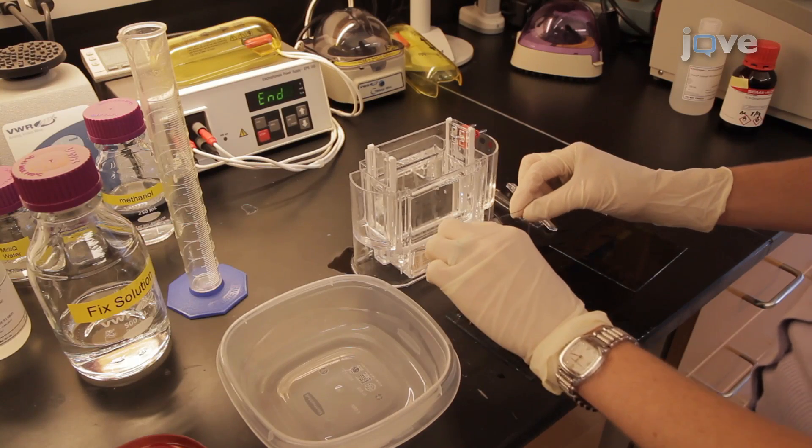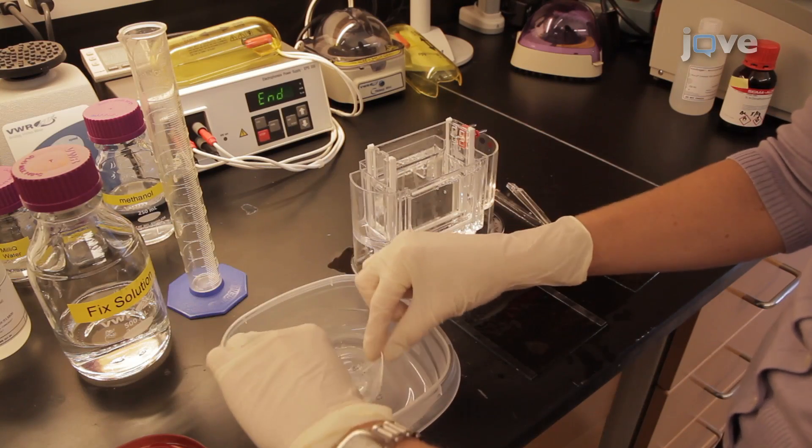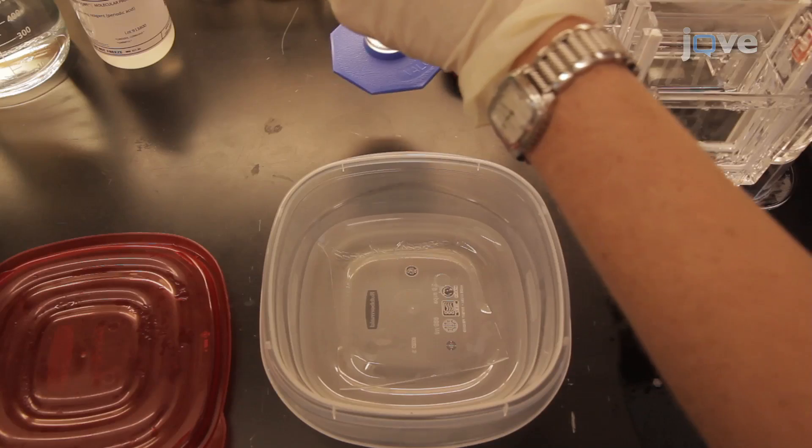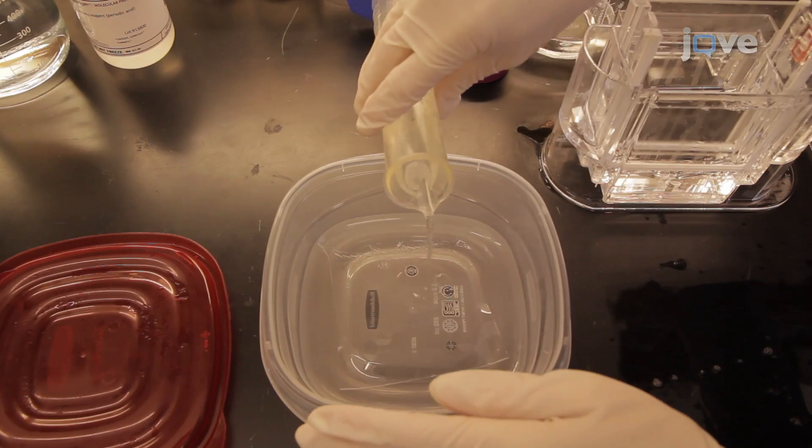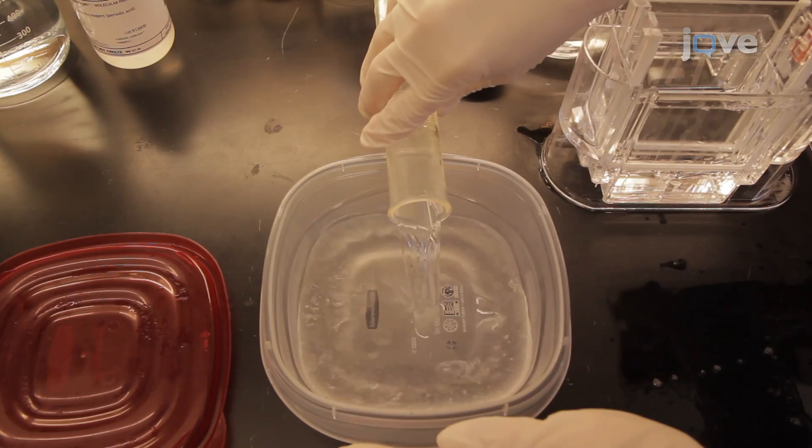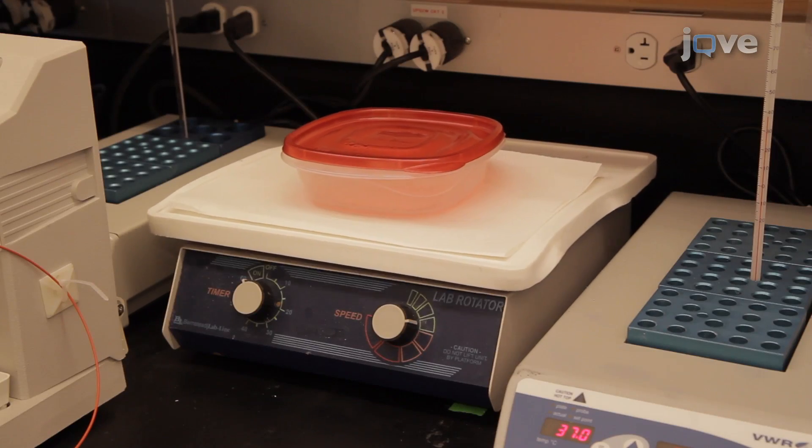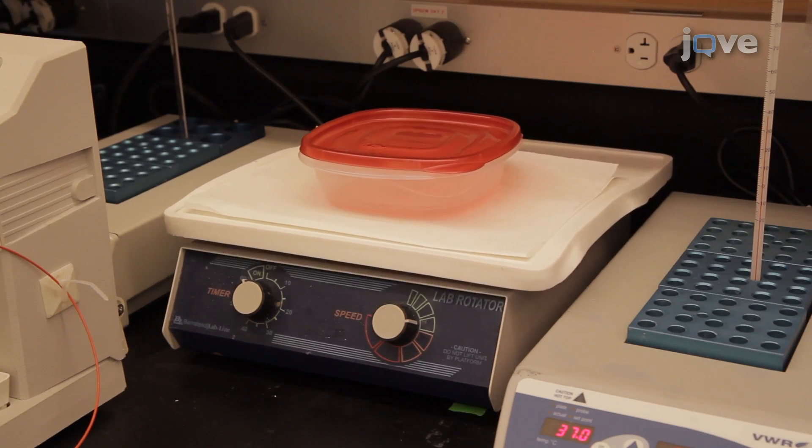When the electrophoresis is complete, remove the gel from the cast and place it in a plastic box. Fix the gel by adding 100 milliliters of the prepared fix solution. Leave the gel overnight at room temperature with gentle agitation.